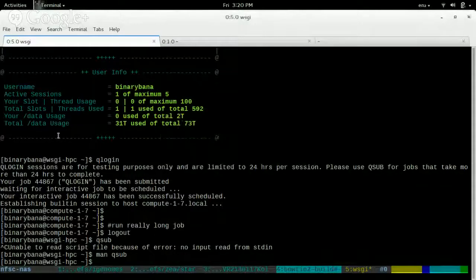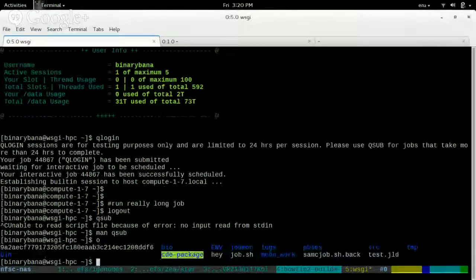So actually, I should show you that. Yeah, let's do a little test. Okay, and this will be the last bit, and then y'all can go do homework, and we'll reconvene whenever.